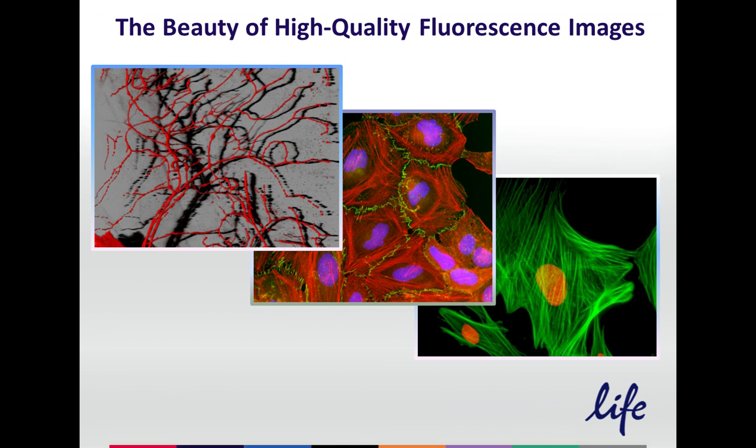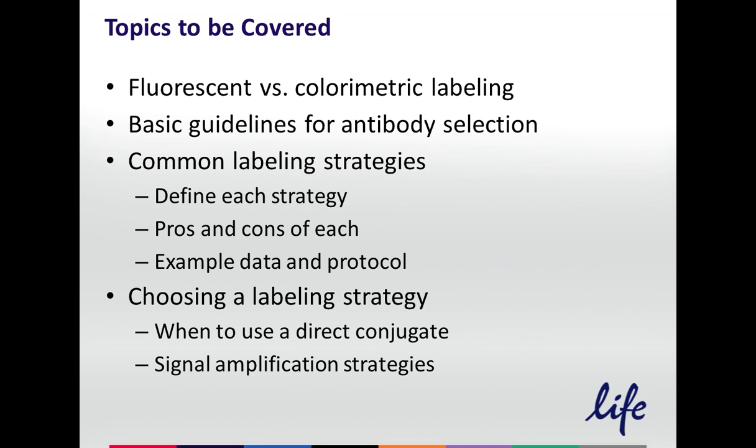So, today we're going to talk about various immunolabeling techniques. The first presentation in this series was at the end of last year, where we talked about tips and tricks with immunolabeling and troubleshooting guides. And today we'll talk about the different strategies used for labeling.